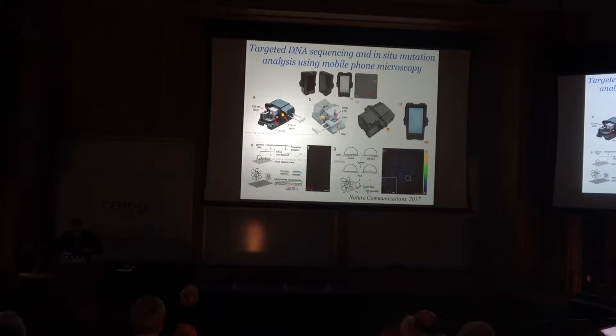You can create multimodal microscopy tools using the smartphone as a platform. For example, here I'm sharing with you 2 fluorescent channels installed on the same smartphone in addition to bright field microscopy. So bright field microscopy and 2 different channels of fluorescence can be superimposed. In this example, we're looking into reading of rolling circle amplification products, RCPs, for in situ mutation analysis conducted in colon cancer patients.